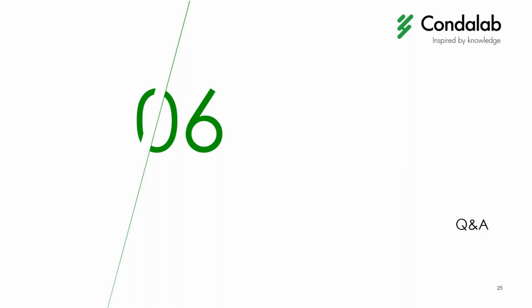So someone is asking if, depending on the matrix that we are working on, we have to change the PCR real-time detection kit. So that's a no. One of the positive things of PCR is that we can use it for all matrices. We don't have to change it.